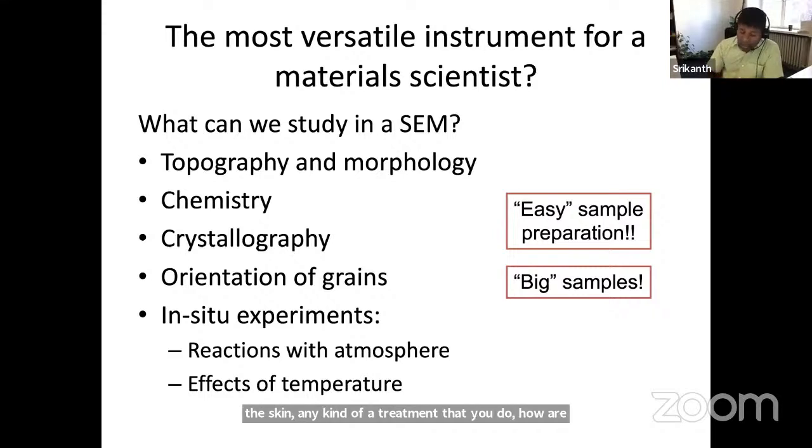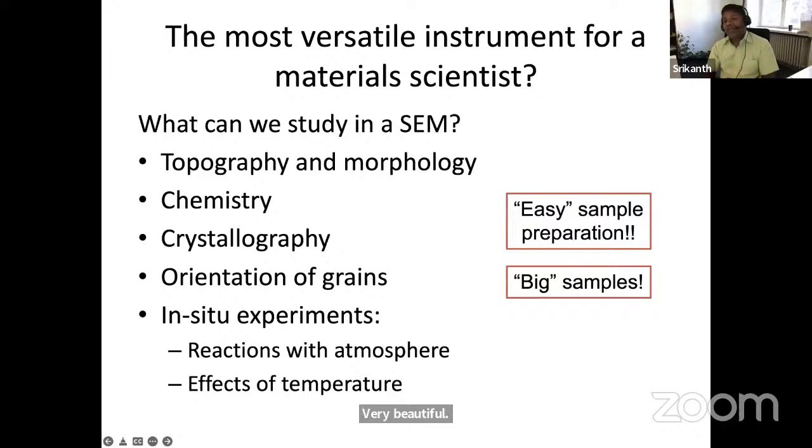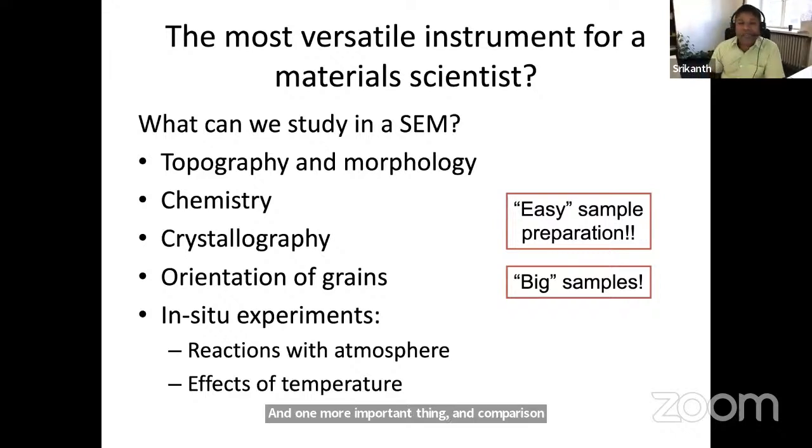For any kind of cream that you apply on the skin, you can study how deep, how thick, how far it goes, and how the cell structure changes. Everything can be studied with modern technology using scanning electron microscopy, because you can see the surface very beautifully. And one more important thing in comparison to transmission electron microscopy is that it's very simple.